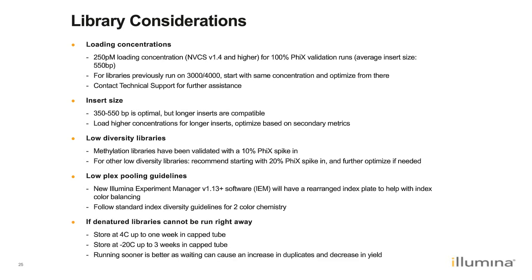If the libraries have already been diluted and denatured and transferred into the library tube, but the run was not able to be started as planned, that library tube can be popped out of the cluster cartridge and saved at either -20 or 4C for a later time. For optimal results, we should use the sample as soon as possible, though.